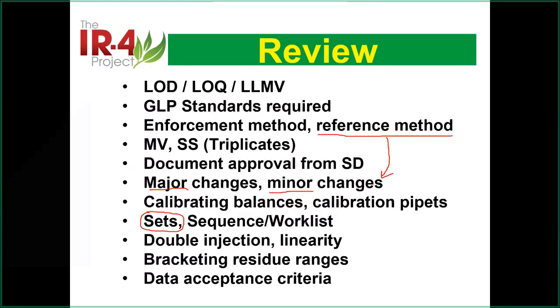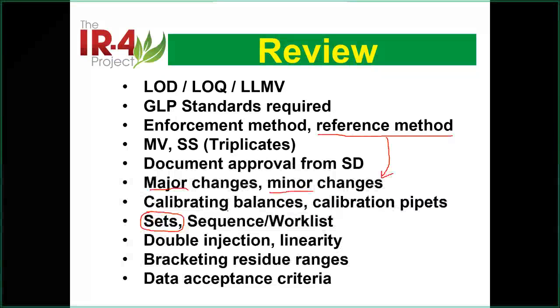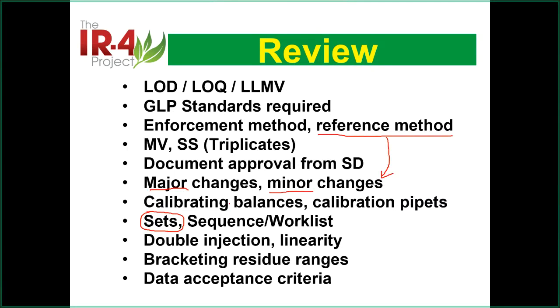You can have multiple sets in one sequence when you run the samples, do the extraction and the analysis.